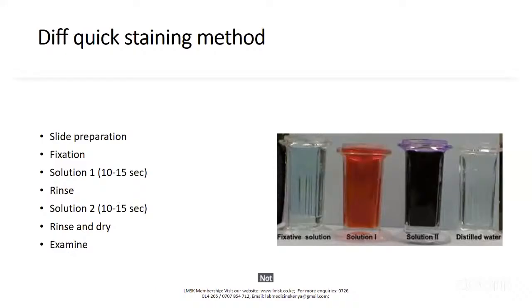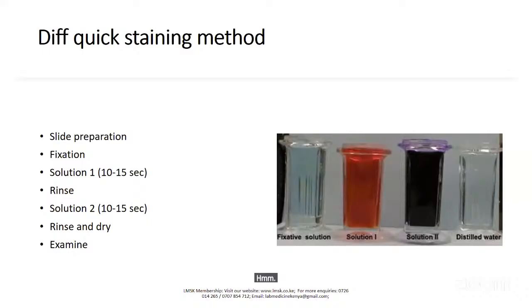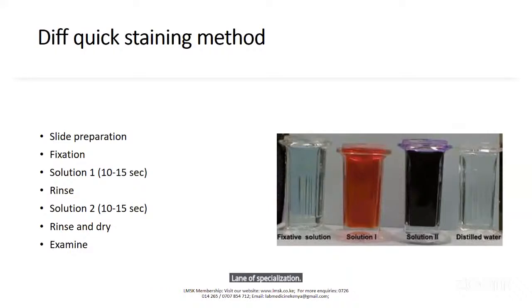Not really. And maybe my simple question would be, apart from the microtome, which I've seen there, and the H&E stains, is this department, do we have fully automation in this line of specialization? Would you kindly visit Kenyatta National Hospital one of these fine days, and you see the magic behind histology?